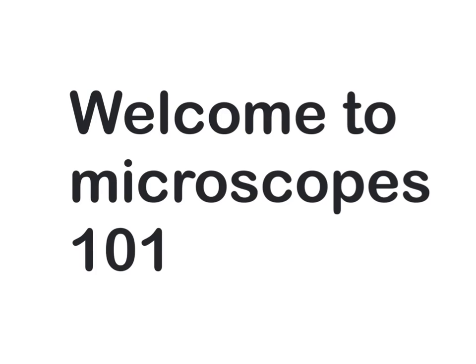Welcome to Microscope 101. By the end of this video, you should be able to state the structure and function of the parts of the microscope, as well as know how to use the microscope in a safe manner.